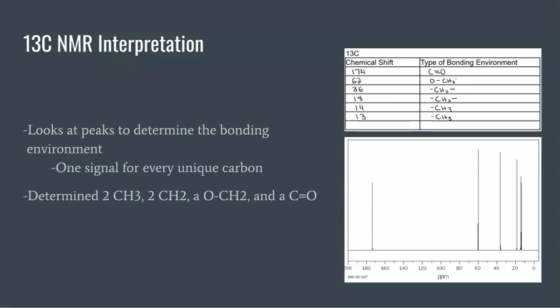The chemical shifts on this spectrum are caused by electron density around the carbon nucleus, which is influenced by the electronegativity of neighboring atoms, the hybridization state of the carbon atom, and the presence of nearby functional groups, leading to de-shielding effects, lowering electron density and causing a downfield shift. This will all result in a higher ppm value, that parts per million value.